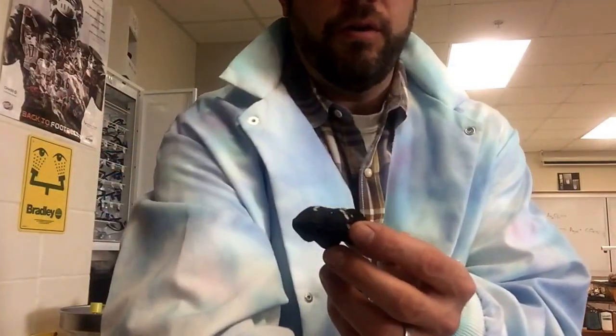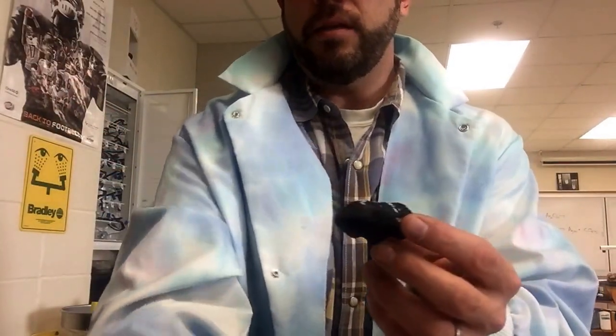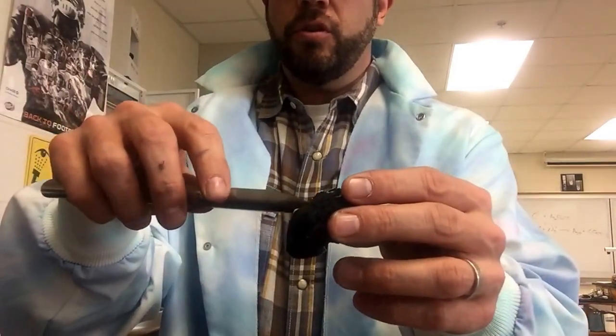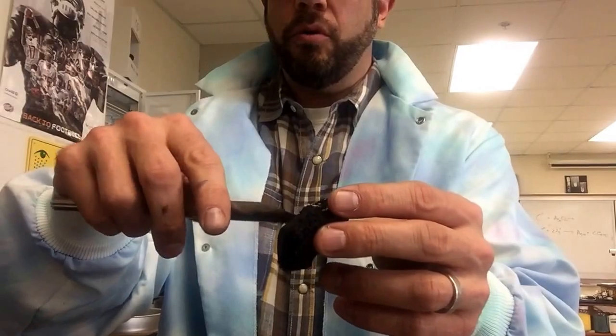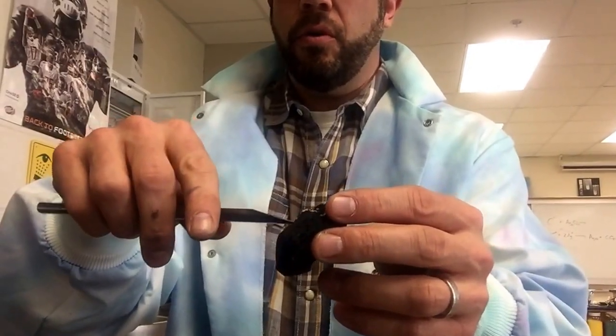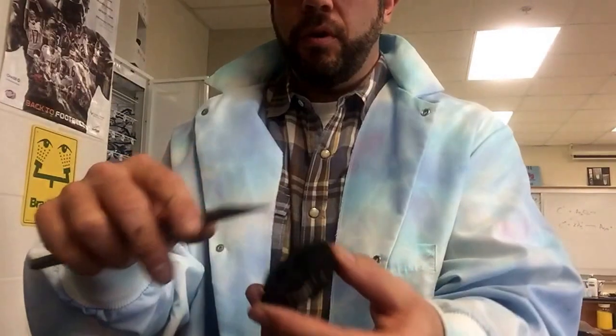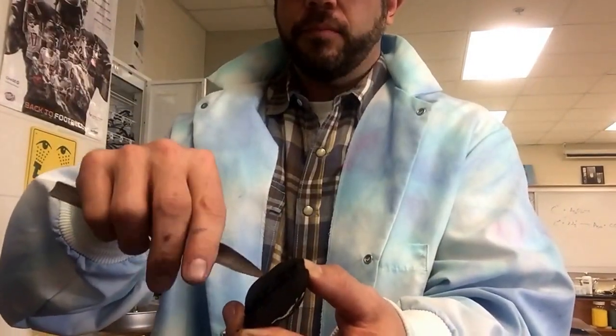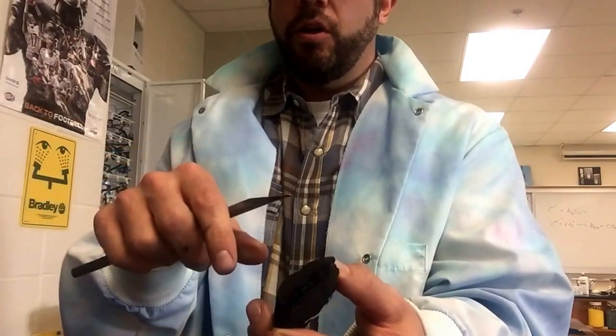First thing you're going to want to use is a spatula here. You're going to use the spatula on the charcoal to kind of burrow a little bit of a hole — not a huge one, just a little bit of a hole on one side of the charcoal. Flip it over and burrow on the other side too. Just want a little hole so that the powder doesn't fly all over the place. I put a piece of paper towel underneath to catch all the little pieces of charcoal so it doesn't make a mess all over the lab bench.